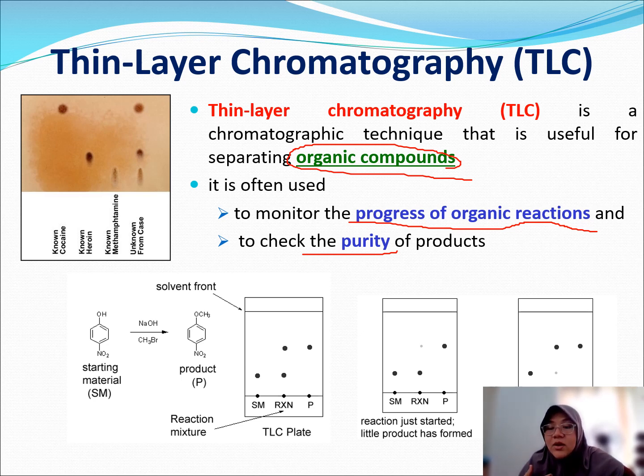Bila kita dapat result, we want to know what actually the peak ataupun the komponen yang elute tu adalah apa, so kita kena refer pada standard. So in this TLC technique, kita boleh letak our standard first, and then our samples, and we want to compare. Oh, this is the standard of M, and then we run our samples, or ada M in our extract. So then this can prove that our samples present with this type of compound, the M compound, okay, like that.